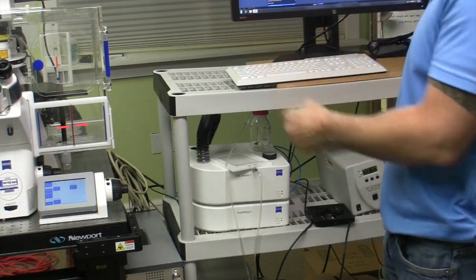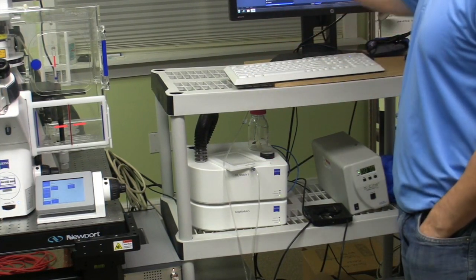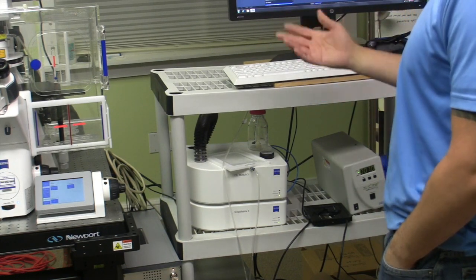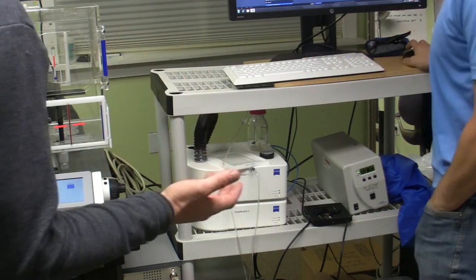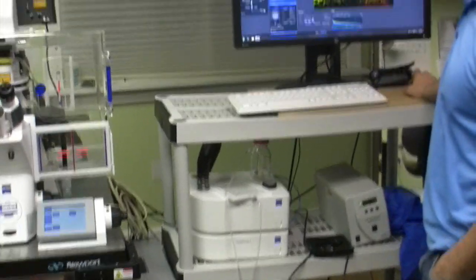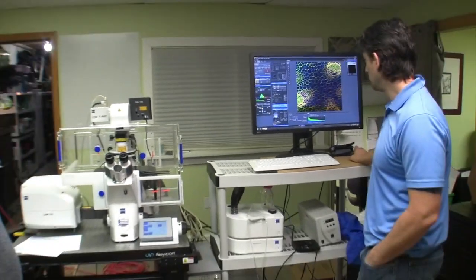Sometimes people leave the cells on for the whole time, and they set up a time lapse. So every so often it takes another picture, to see if the cells are growing or if they're dying or whatever. So you take the sample, you set the machine up, you run the experiment, you walk away.